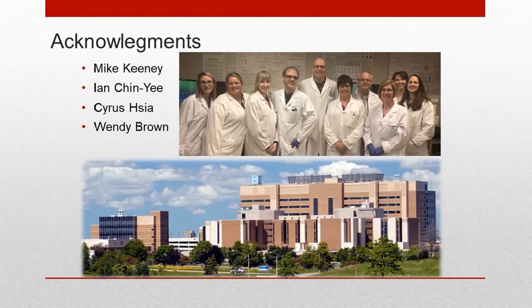Thank you. If you do AML MRD, would you use the M1 and M2 tubes in the panel with 1 or 2 additional tubes, or do you have to develop a separate AML MRD with total disregard of the M1 and M2 tubes? Yeah, that's a good question. I've been asked that one before.